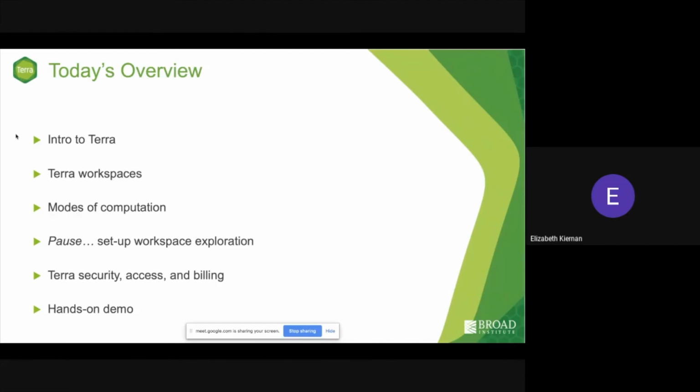We'll, at that point, actually pause the slide deck, and we will go into the internet browser, into the actual web application. We'll set up our own workspace and launch a runtime environment. And then we're going to pause there and come back to the slide deck while the runtime environment is getting spun up, as that takes a little bit of extra time.